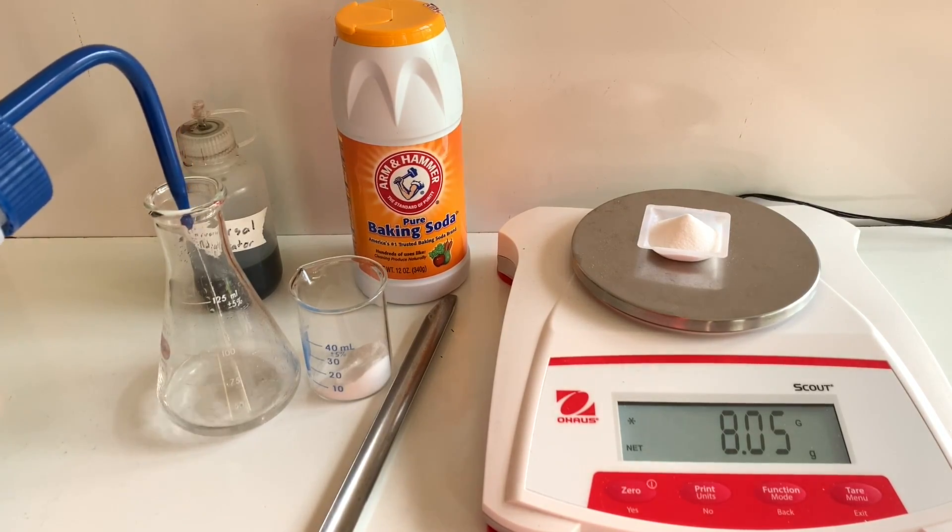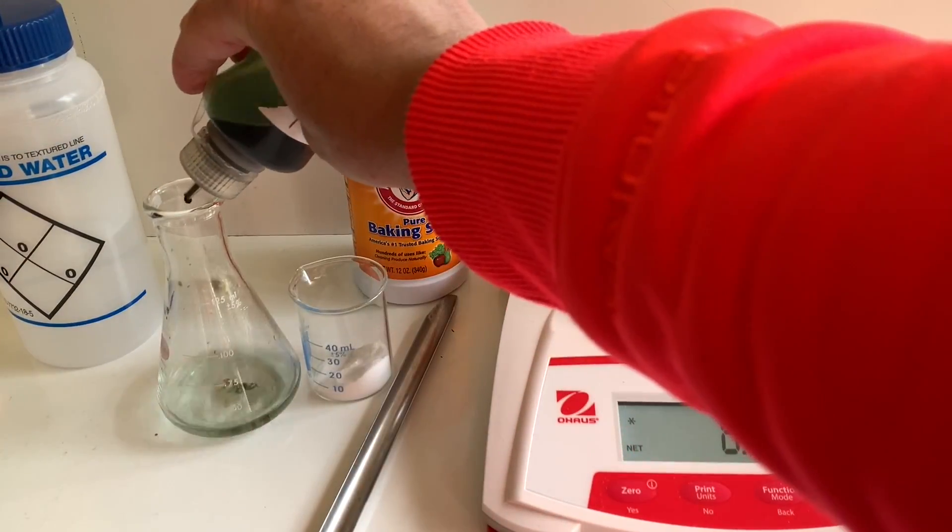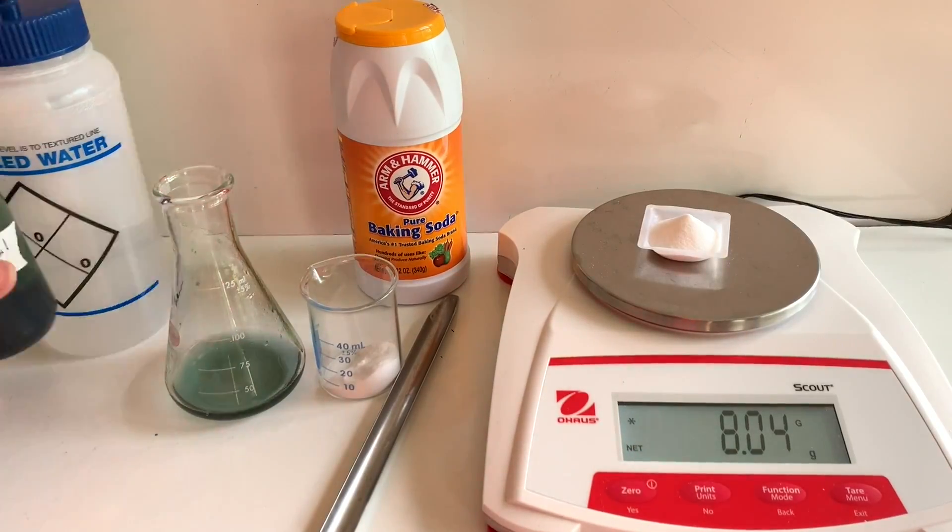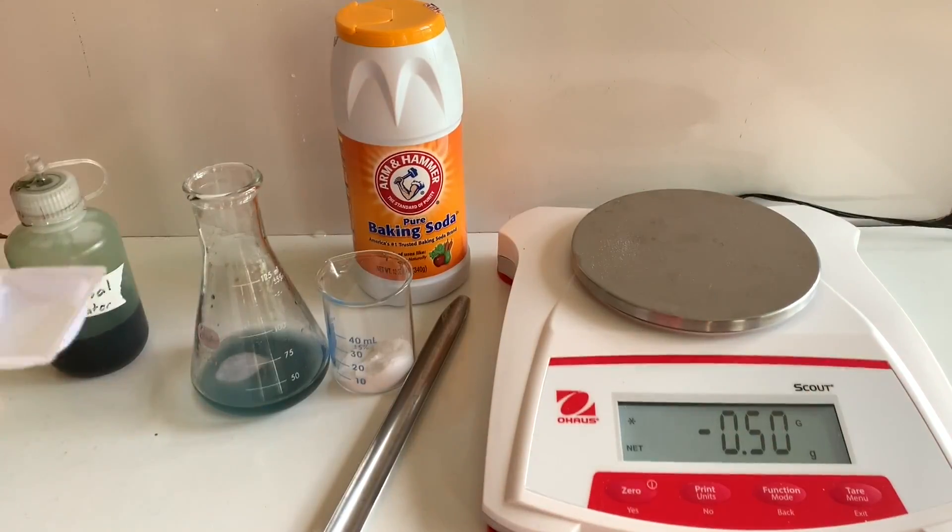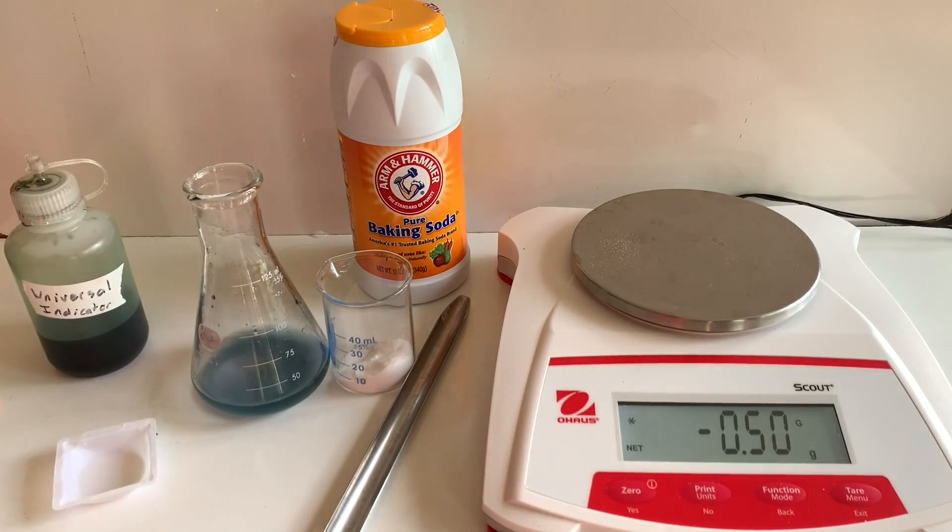I added universal indicator to show that water starts out green, which is neutral, and then when you add the sodium bicarbonate it's turning to a bluish color signifying that sodium bicarbonate is a base.